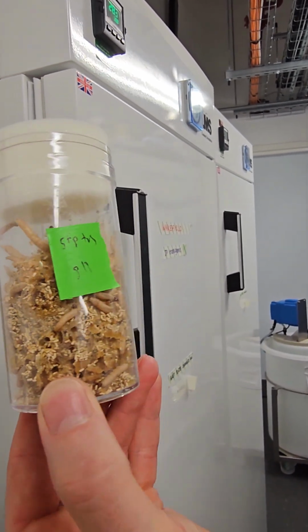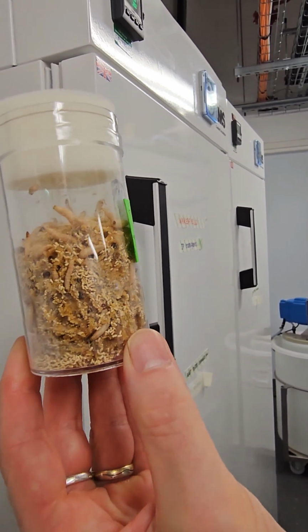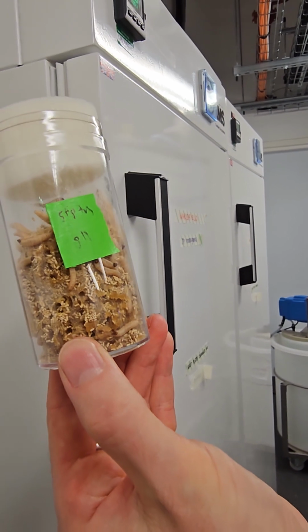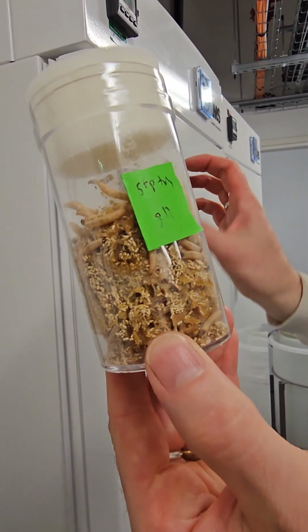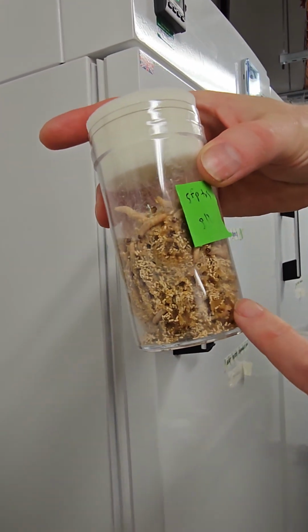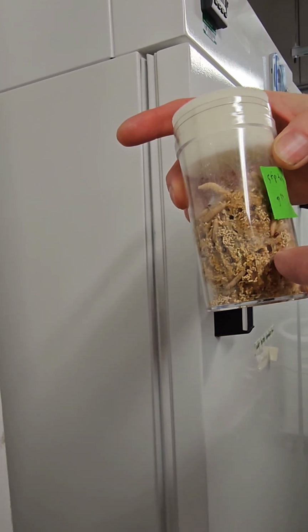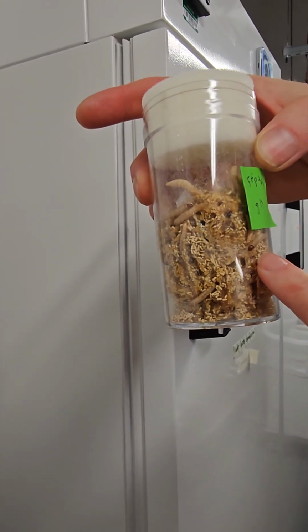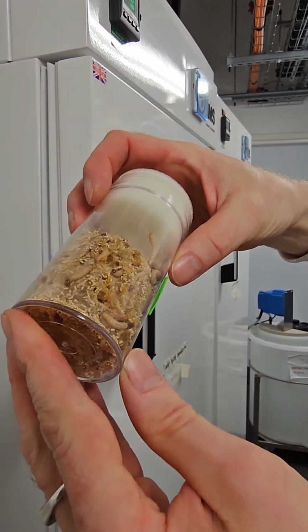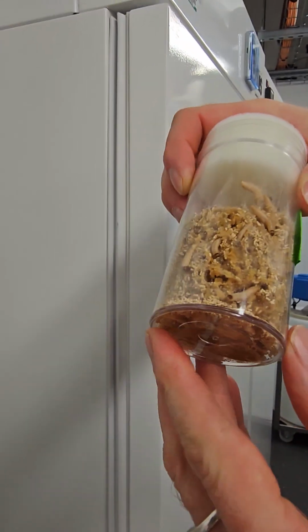So you can see there are the larvae. They're much bigger than the fruit fly, and actually these are the smaller larvae. They get to be a little bit bigger than that even. There are tiny little things also, these little dots down there. The little mites that are... Oh no, that's just their heads. That's their heads. Oh, I saw it as a separate creature. Isn't that weird? They're wandering along all like that. They're quite happily away. They look very happy actually, very busy.